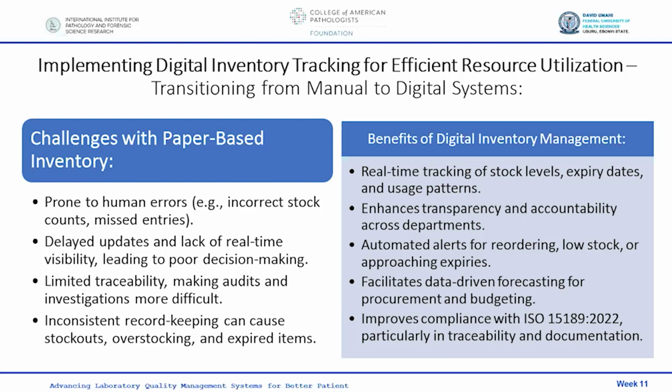Now, the benefits of a digital inventory management. It encourages real-time tracking of stock levels. You see the expiry dates. Once you've entered the information of a particular supply, it's there and you see it in real time. You can call it up whenever you need it. It can also show you the usage patterns in real time. You know the quantity you keyed into the digital inventory, and when it is taken out, you see it in real time. There can even be an alarm system in place to alert you when you are running out of stock.